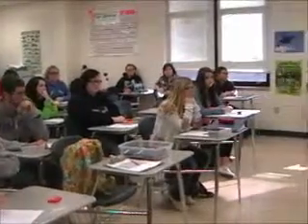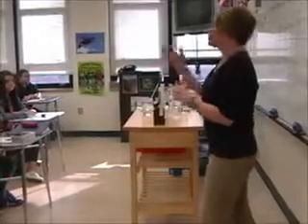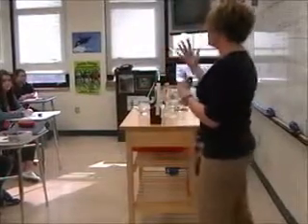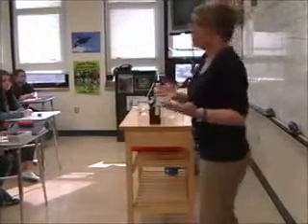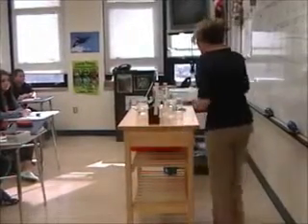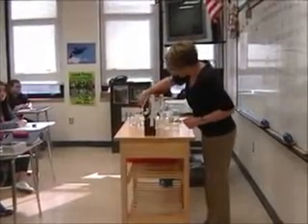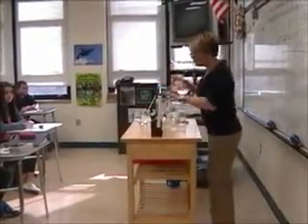So let's go with both of those. You're thinking it probably isn't going to make a lot of difference, but you're also thinking conceptually, even mathematically, that if we double the concentration, maybe it's going to cut the time in half. So let's see what happens. Okay, so we need our 50% solution. That's this one.